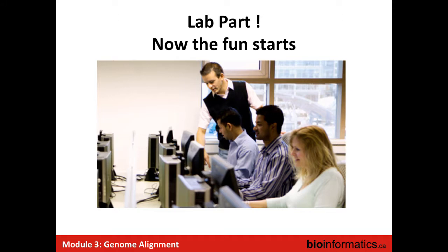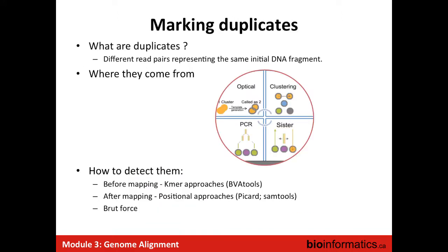So it's my understanding that the reason we use Phred scores is because they can be summed when you're comparing your confidences. For example, if you have paired-end reads with an overlap, in the overlap region, when you have agreement, you can sum the confidence score because you have twice the evidence for that point. And if there's a contradiction, you take the difference, because your more confident call is reduced by your less confident call.